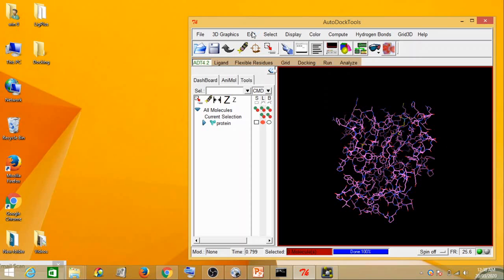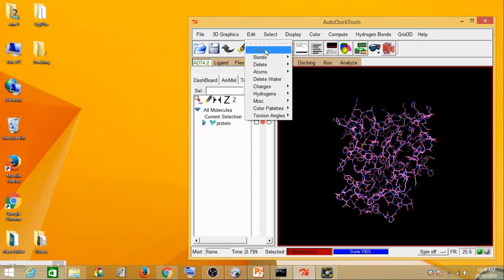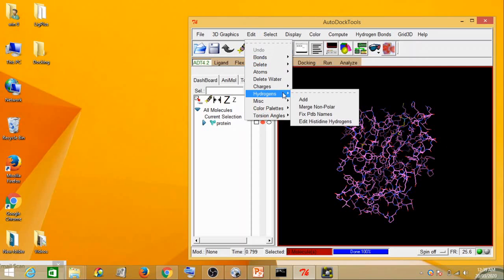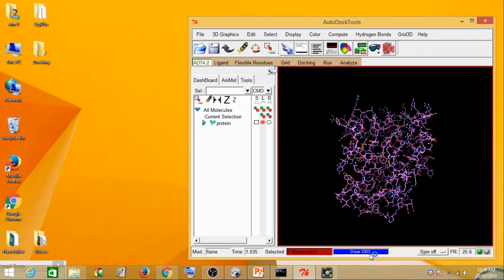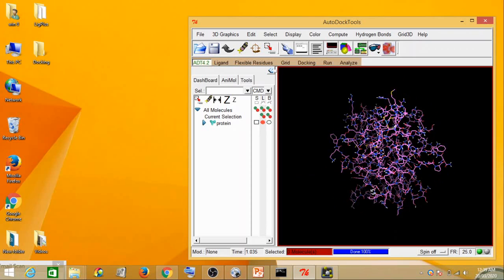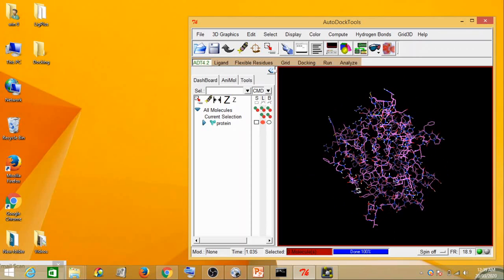The second step is you again go to Edit, go to Hydrogens, and then add hydrogen. You go to Hydrogens, click on Add, this dialog opens, then you click on Polar. So you add polar hydrogens to the protein. You can see 100% — polar hydrogens have been added to the protein.